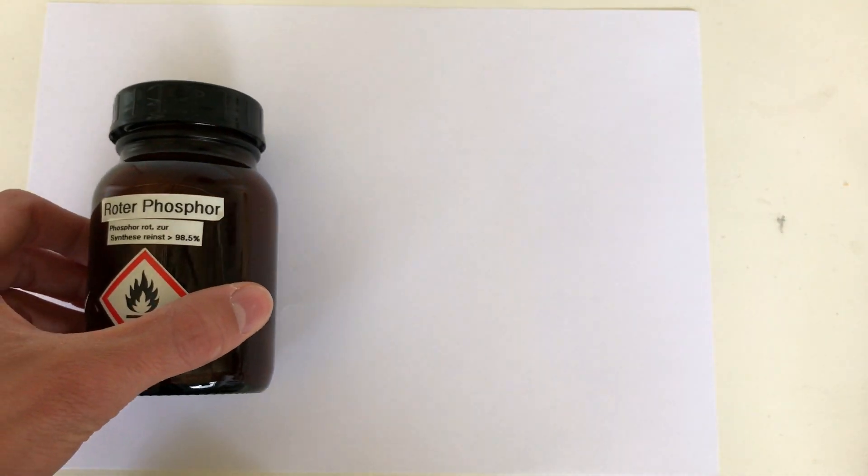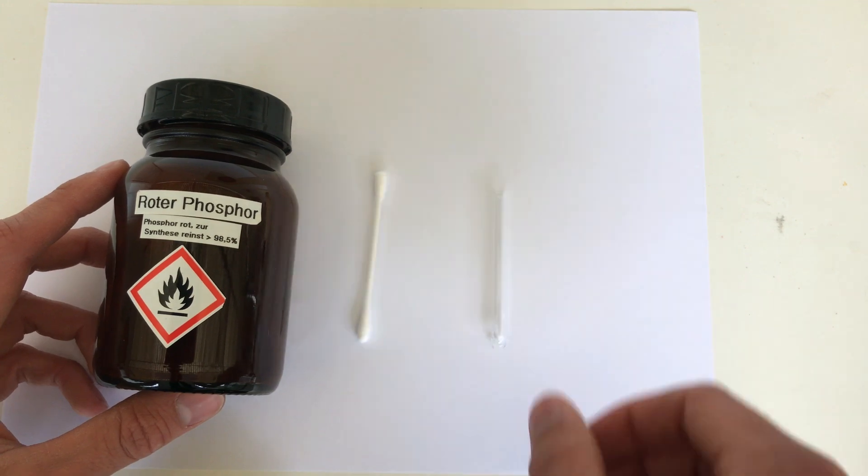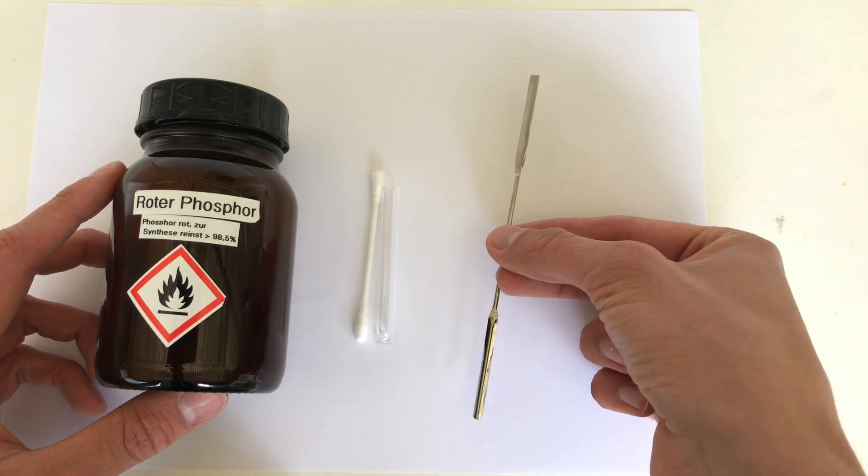Welcome back everyone. Today we are going to make some white phosphorus on a micro scale. To do this you will need red phosphorus, a q-tip, a small glass tube, a spatula, and some sort of Bunsen burner.